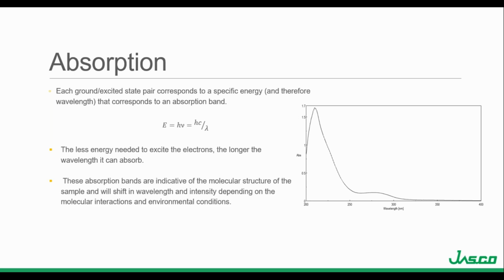The absorption bands are indicative of the molecular structure of the sample and will shift in wavelength and intensity depending on the molecular interactions and environmental conditions. These bands are typically broad and featureless due to the numerous molecular vibrational levels associated with the electronic energy level.